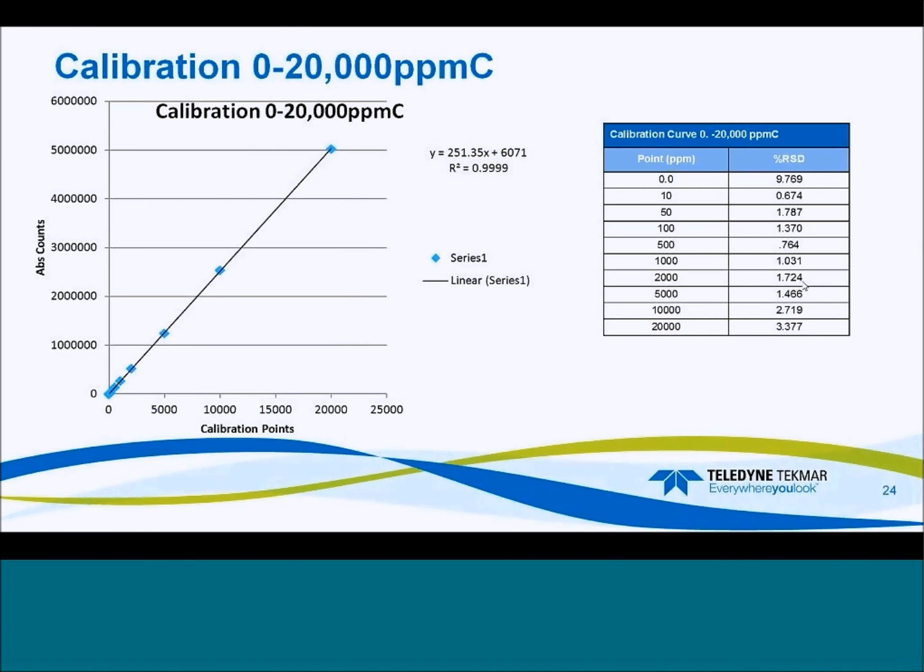So we analyzed our salt samples with a 0.5 mil injection loop. We produced a calibration from 0 to 1,000, and then finally a calibration to 0 to 20,000, all using the same method and using the same injection volume.